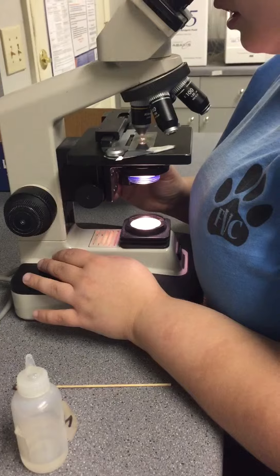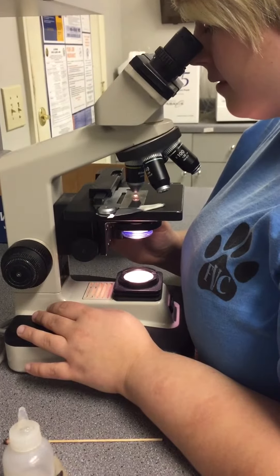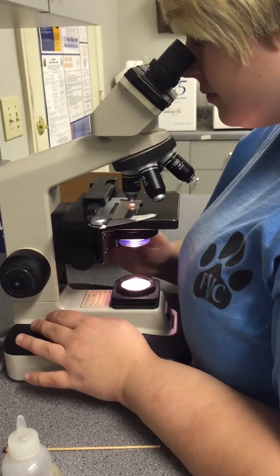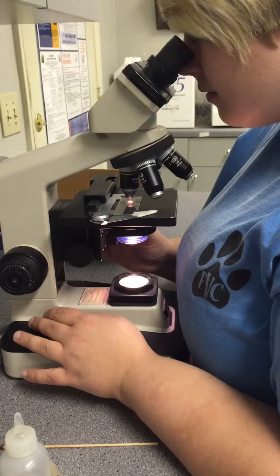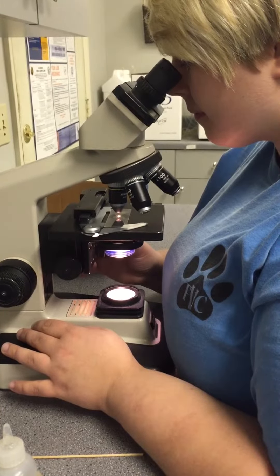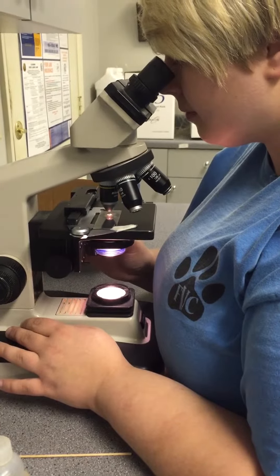Just going to look. I'm just going to roll that off and it's on the mic.